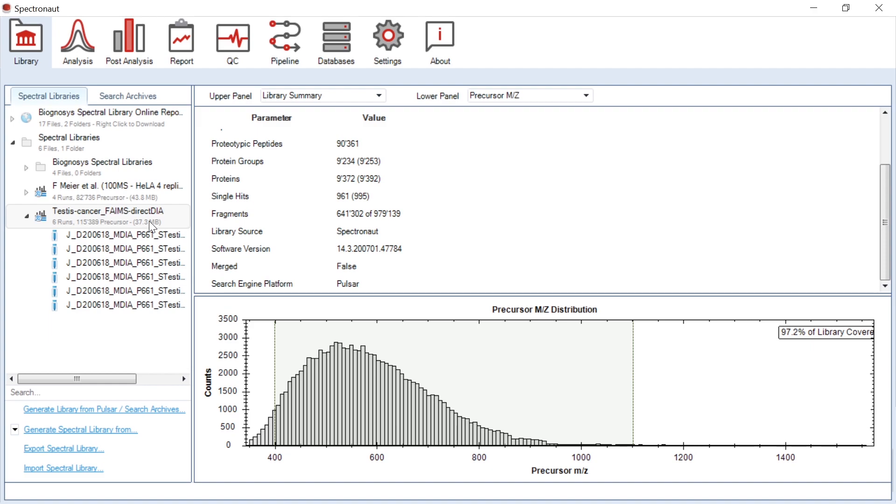Now, I would like to show you how you can analyze data acquired with DIA FAIMS, a technology proposed by Thermo.